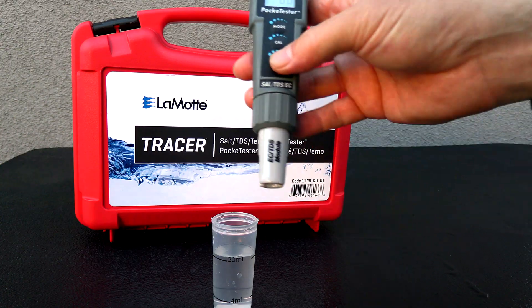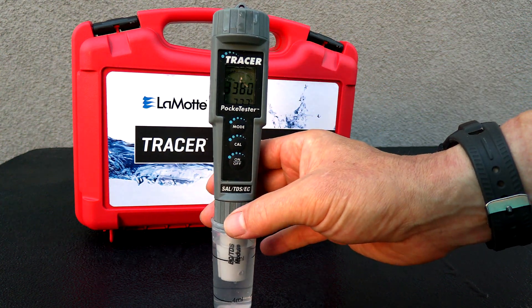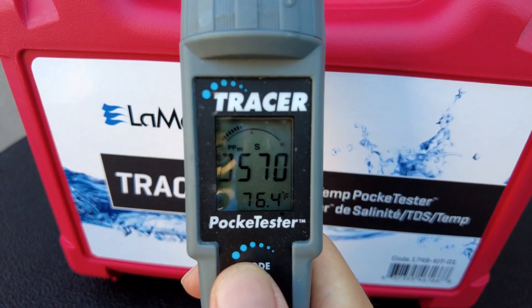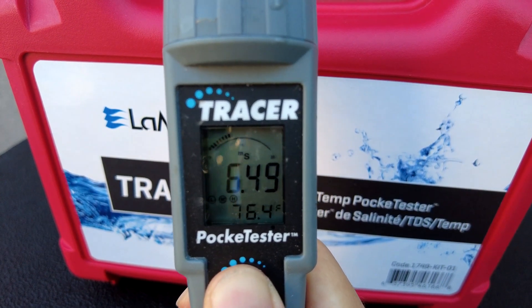Here I have a sample of some pool water. The salt level is roughly 3,500 parts per million. You can easily change between salinity, conductivity, and TDS by pressing and holding down the mode button.